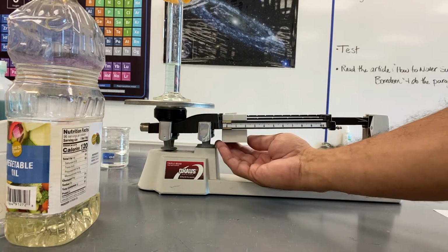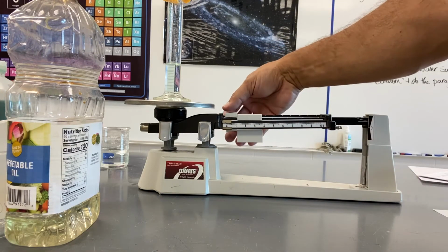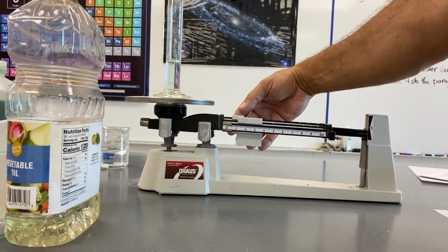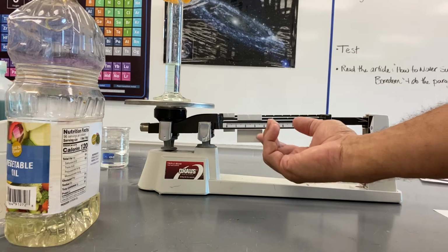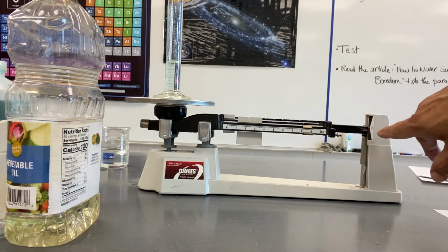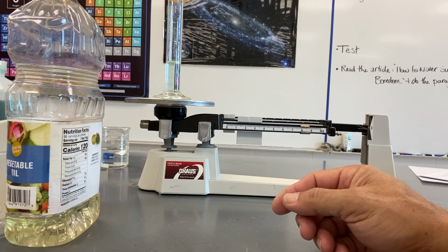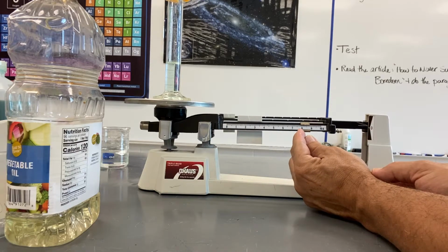with 20 milliliters of water in here. So I'm gonna start off by moving the big unit up to 100. Now I'm gonna move my 10s. Nope, 20 is too much. Back to 10. 10's too much. Go with our small units. And I'm watching out here for that to be at 0, so I'm a little heavy, even though I'm really, really close. Okay, coming back the other way just a touch.